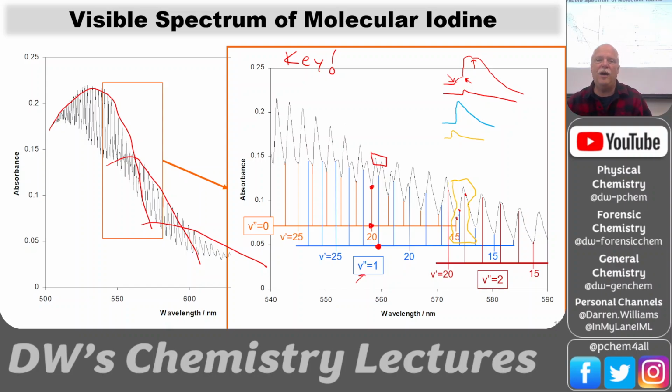Like I said, only my mom would believe it, right? No, really, Mom, that's what it is. Okay, dear. Yeah, but I'm following what the guide was when I was doing this lab as well. I was like, okay, that's what they're doing. They're saying where the slope changes, that's where that band head begins, and so we're just going to pick that.